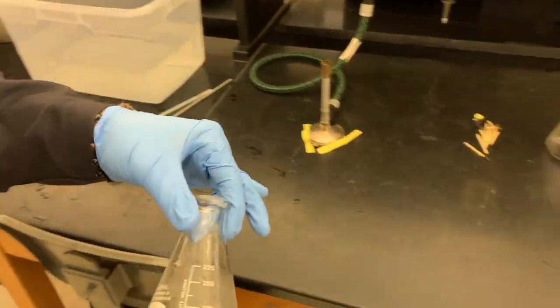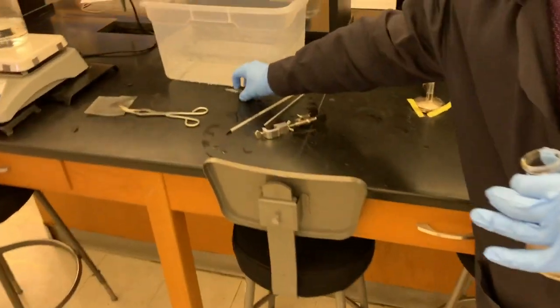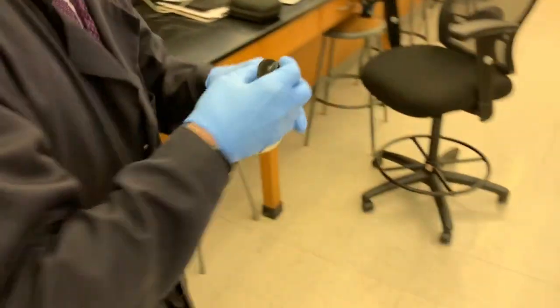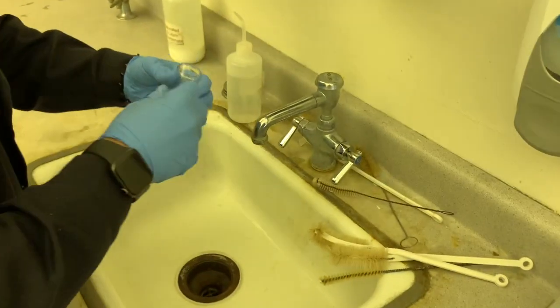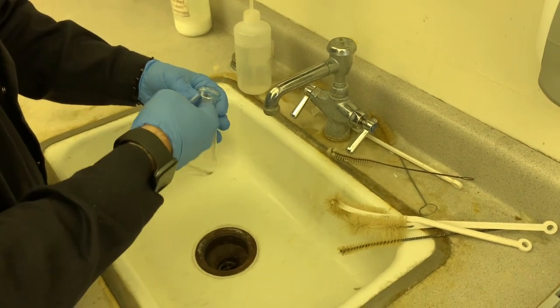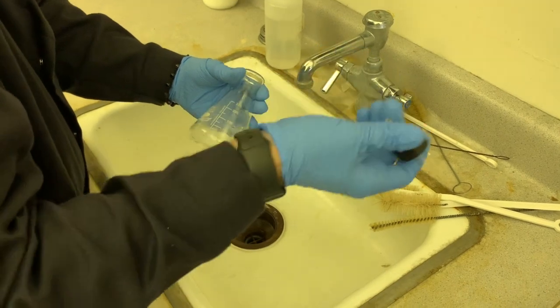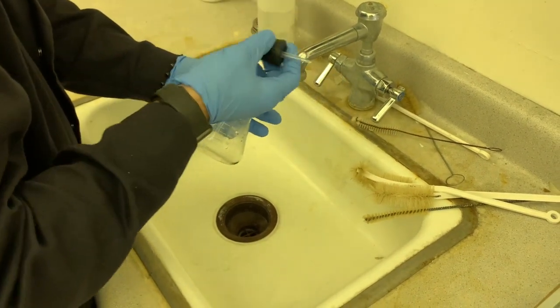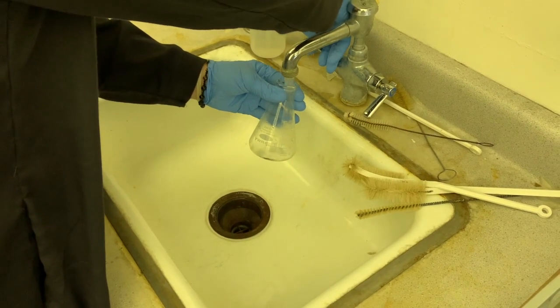So you're gonna take your flask and grab the top, because that matters too. And we're gonna go fill it up over at the sink with a little bit of water. Now you have graduations on here, but they're not all the way to the top and for the full volume of the flask. So what I'm gonna do is go back and get the graduated cylinder, and find the volume of this once I fill it up entirely.